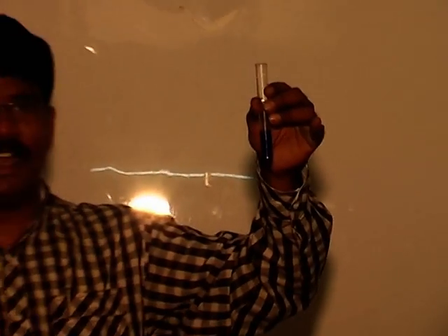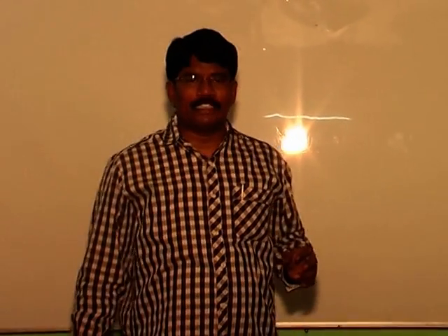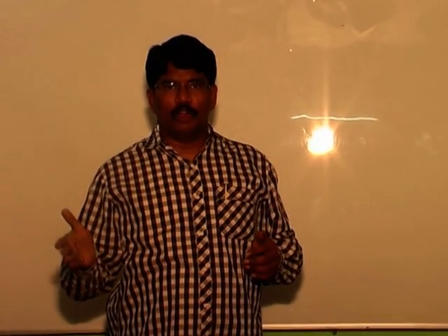Now a bluish color precipitate is formed. If the bluish color precipitate is formed, then cupric ion is confirmed. If ever in the second group also no precipitate is formed, then we need to proceed for the third group.